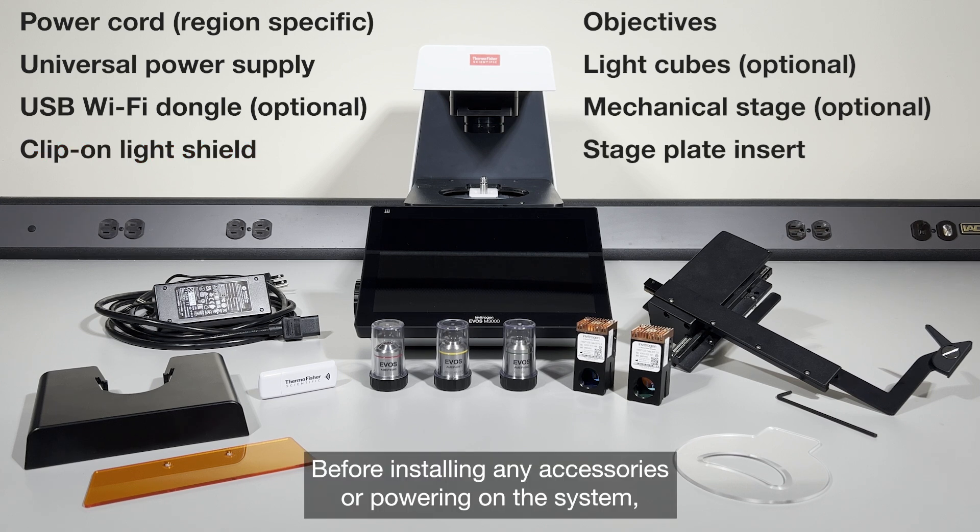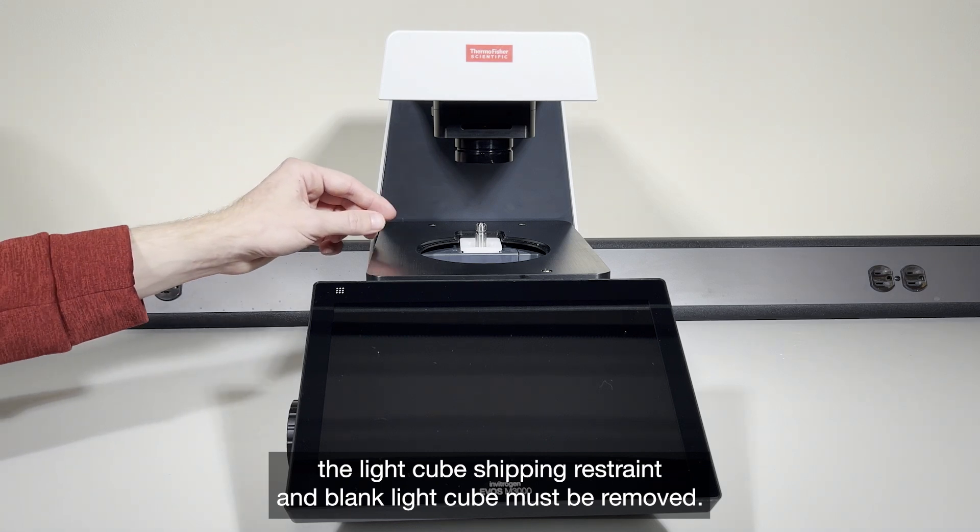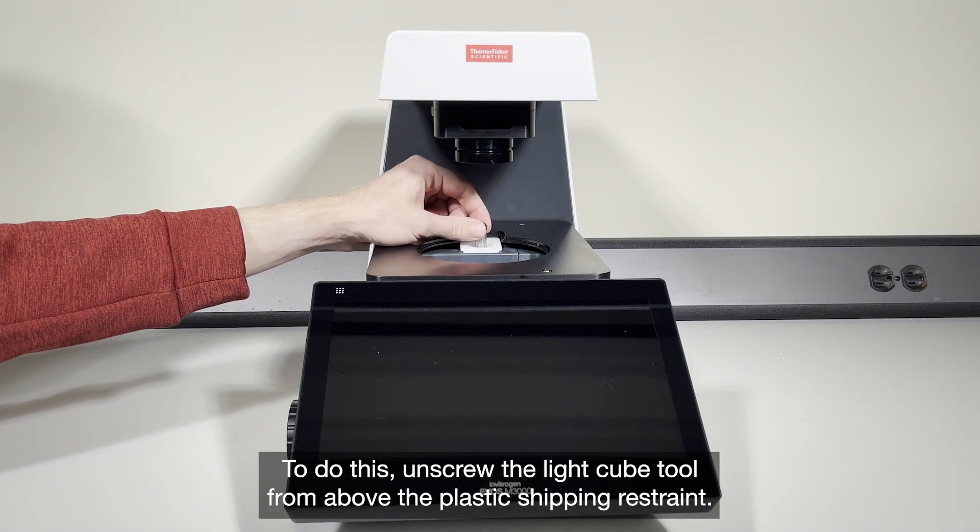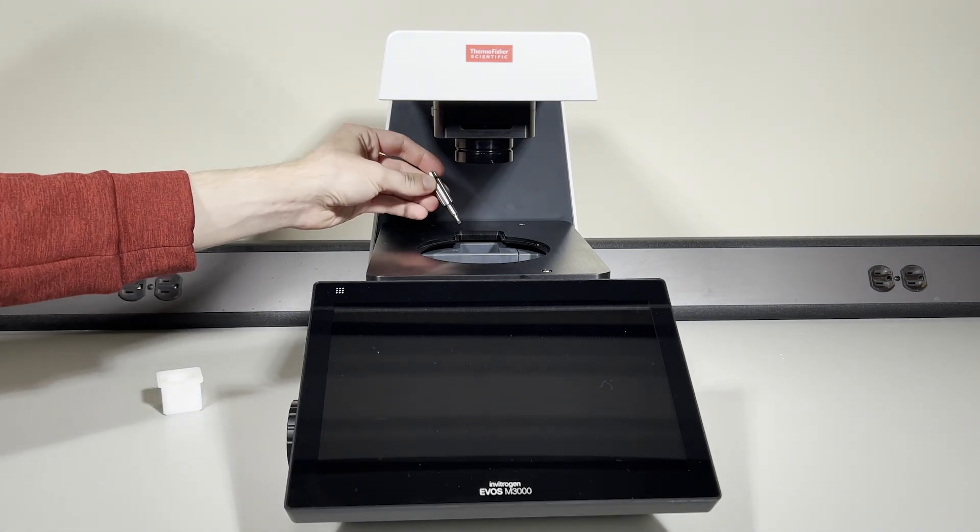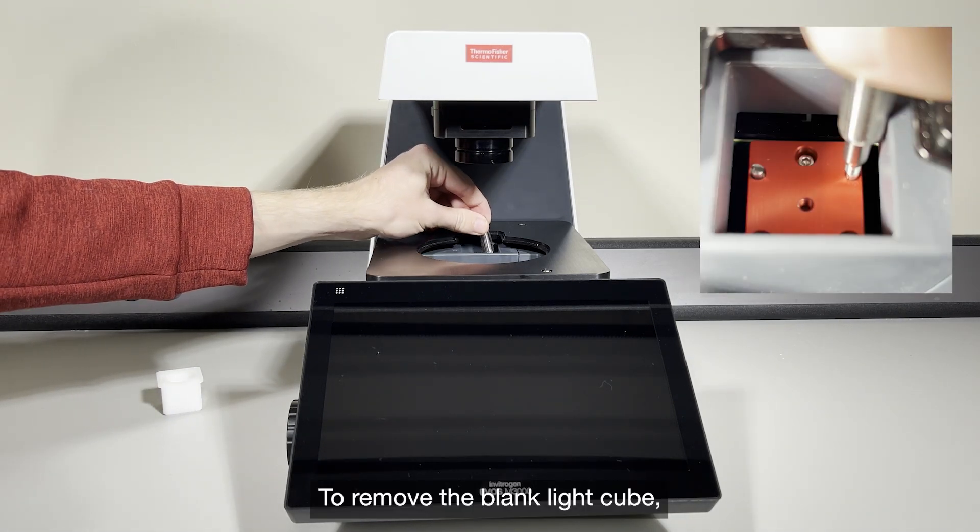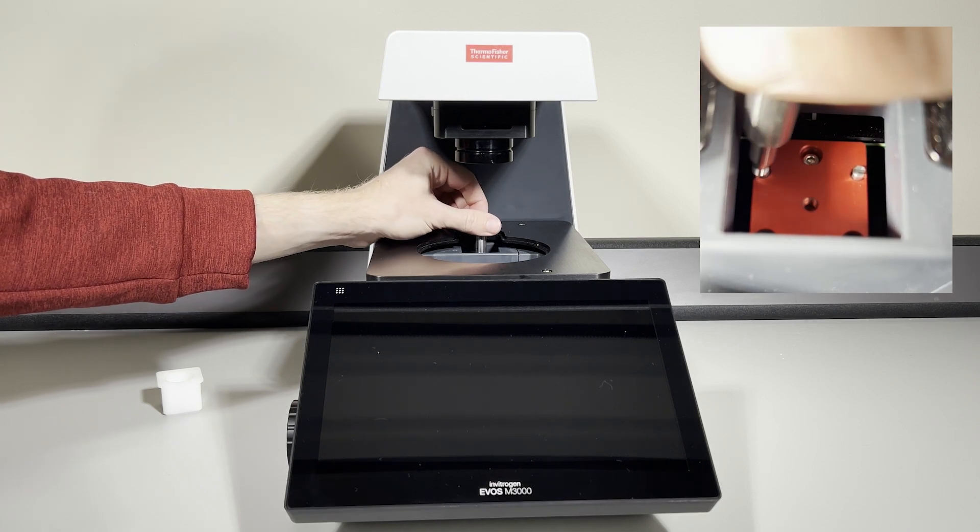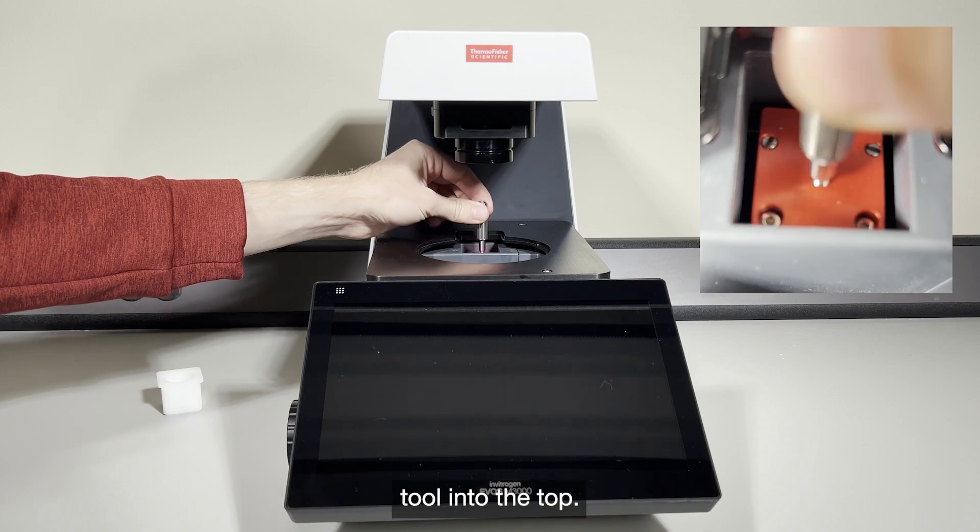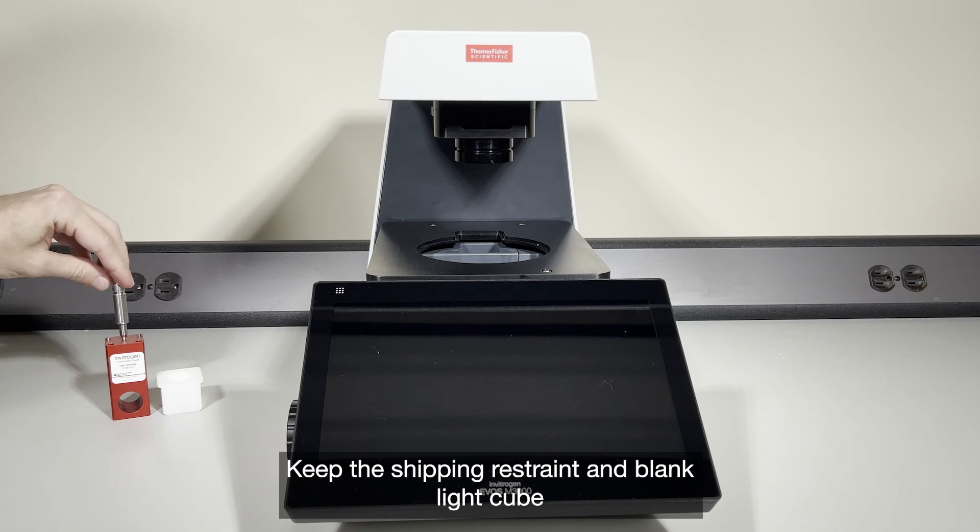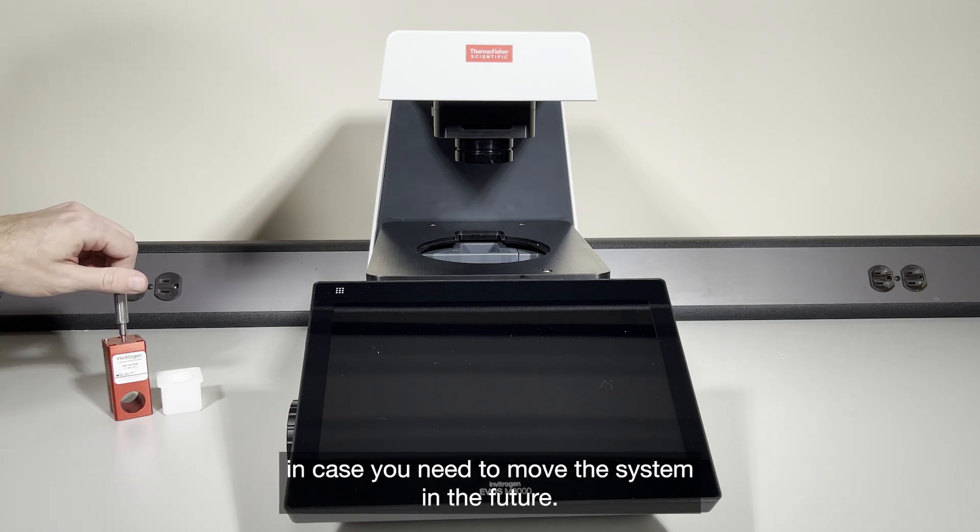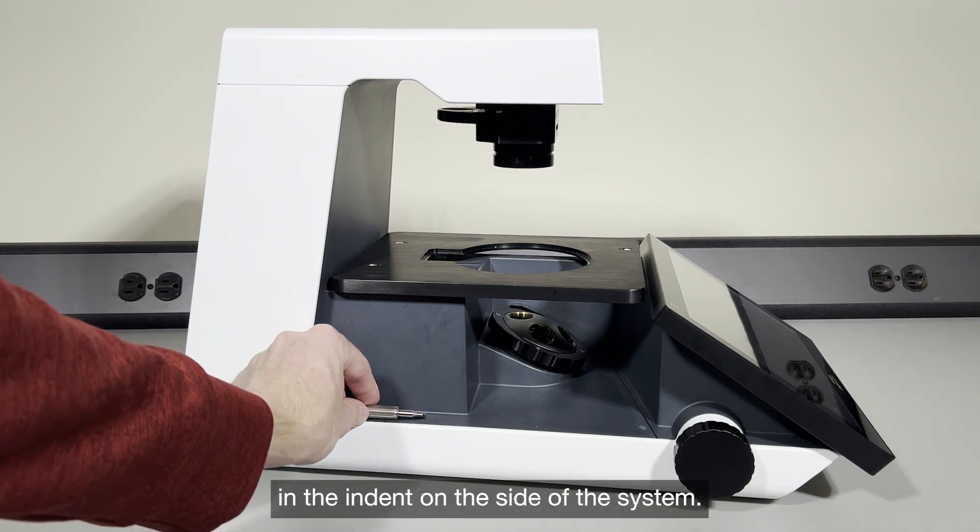Before installing any accessories or powering on the system, the light cube shipping restraint and blank light cube must be removed. Unscrew the light cube tool from above the plastic shipping restraint. The shipping restraint will come out freely. To remove the blank light cube, loosen the screws in the top of the blank and lift it out by screwing the light cube tool into the top. Keep the shipping restraint and blank light cube in case you need to move the system in the future. The light cube tool can be kept in the indent on the side of the system.